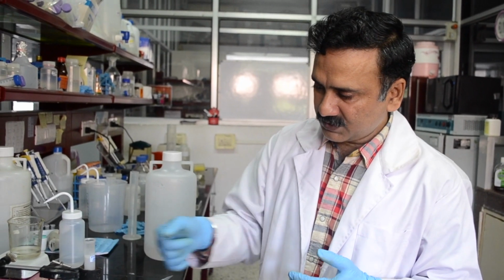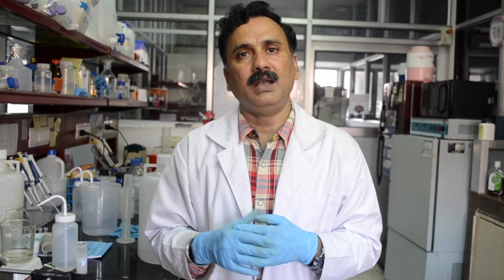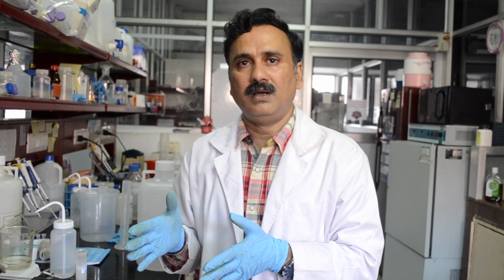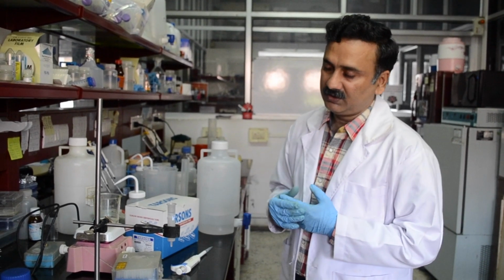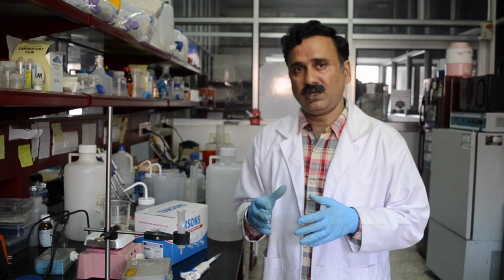So let's first do the equilibration, and then we are going to load the sample, and then we are going to tell you the further downstream procedures. So now what we have done is equilibrated the column with 4 to 5 column volumes of the water or the buffer in which you want to do the buffer exchange of your protein.